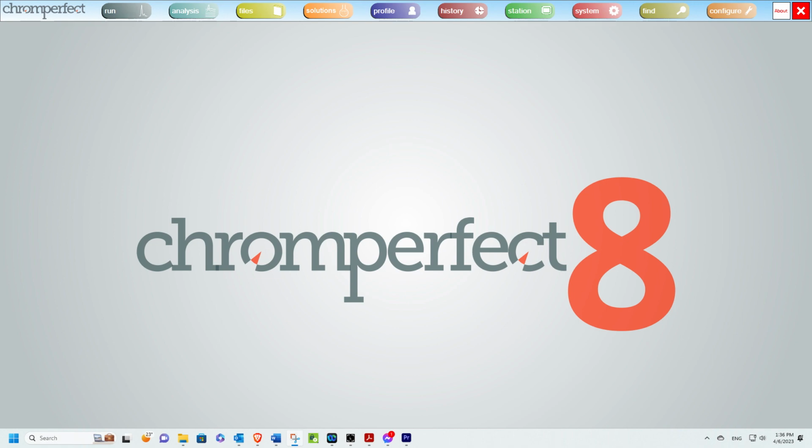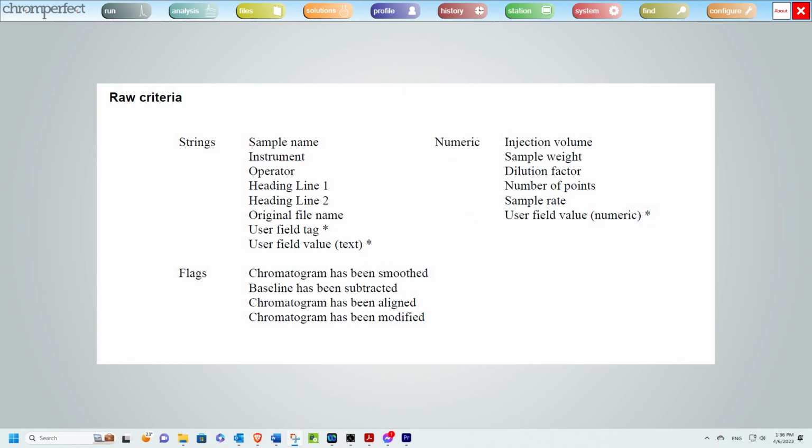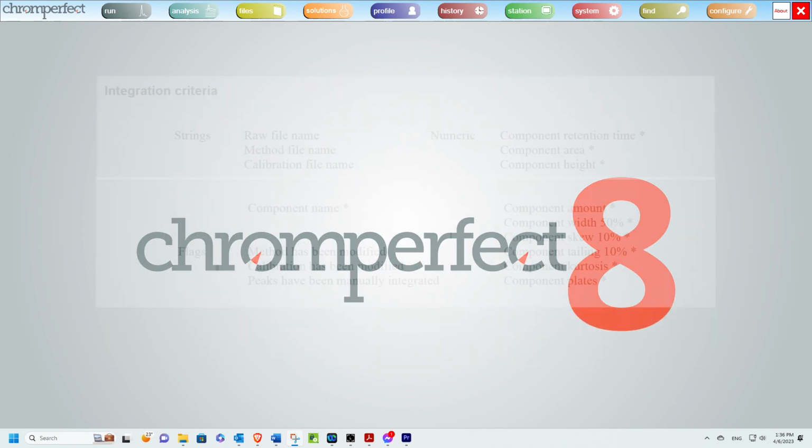List of items. The various items will be displayed on screen within a table for each criteria type. You should pause the video on each table if you want to read through the lists. Asterisks indicate items with multiple targets.